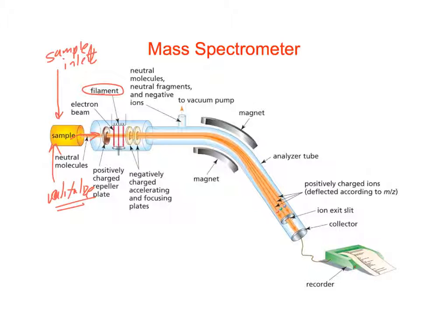And so when that happens, our molecule gets shot by electrons. Essentially, it gets excited, and then it ejects an electron. And so we draw it like this, plus an electron. So this is excess electrons here. All right, and this is a radical cation.